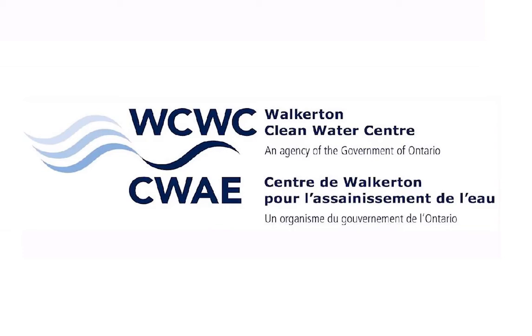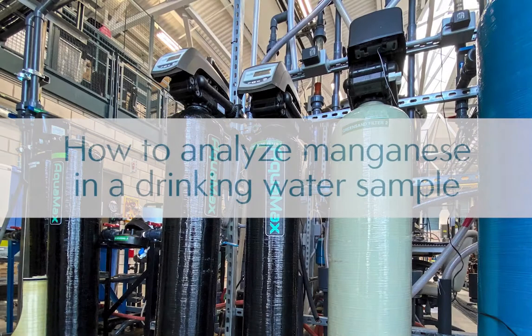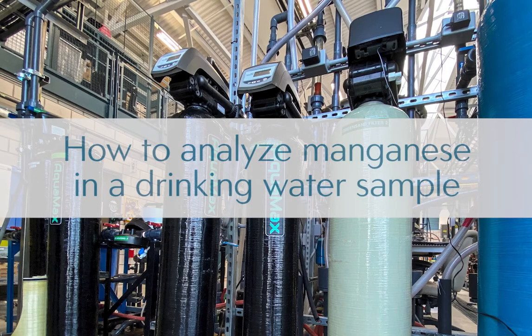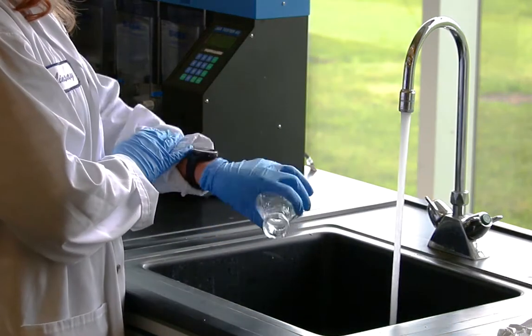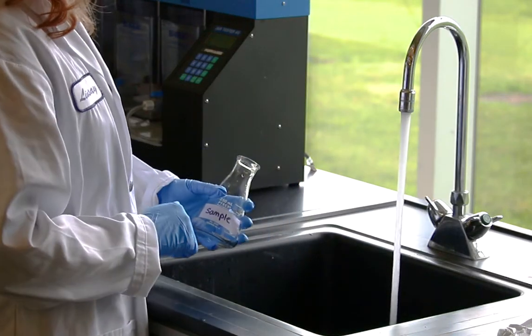This video will demonstrate how to measure manganese in drinking water using the PAN method. This is a basic procedure overview and should not replace or overrule the instructions provided to you by your instrument manufacturer.